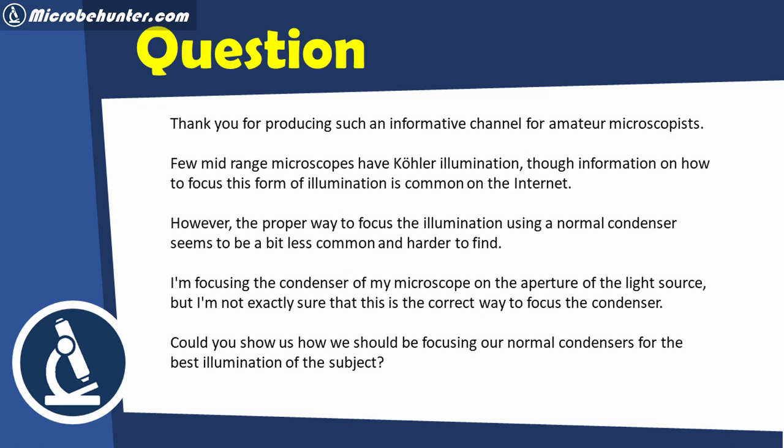I'm focusing the condenser of a microscope on the aperture of the light source, but I'm not exactly sure that this is the correct way to focus the condenser. Could you show us how we should be focusing our normal condensers for the best illumination of the subject?